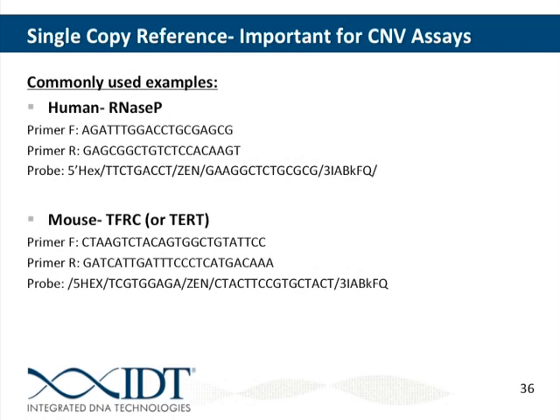And the last question, what does the historical data look like? If I do a PubMed search and get my primer probes that were 10 years ago, would I just start there, or put them through this? I mean, do you think that 10 years ago would give you different results than if you did the analysis today? Absolutely, especially with the SNPs. If there's the potential of any SNPs in those primers and probes, it could greatly impact your data. And 10 years ago, that information wasn't available.